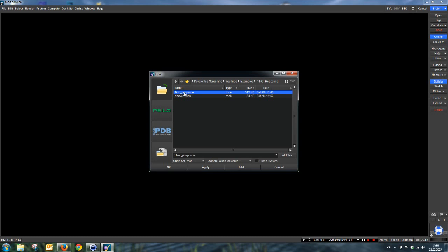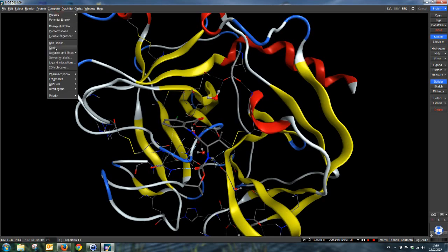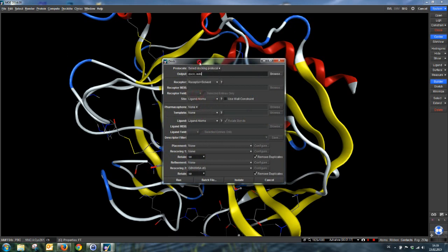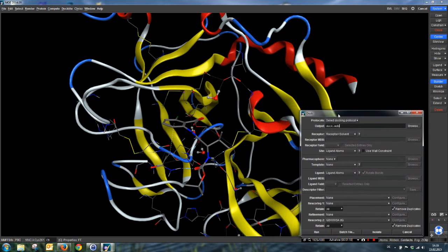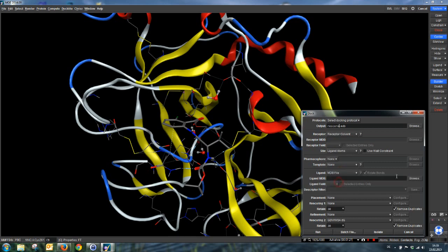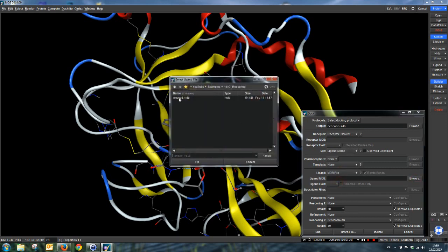To use more internal scoring functions in re-scoring is really, really easy. We can just open the receptor, go on compute and dock. We select post-rescoring as the protocol, name our output file, and use our input file, the cleaved MDB in this case.